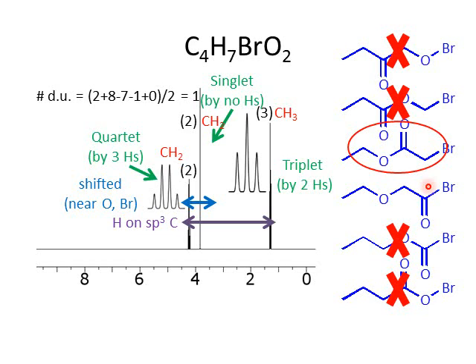If we had other spectra, like IR or carbon-13 NMR, that would also be helpful, because for an ester functional group, that carbon in the carbon-13 NMR turns out to come at a slightly different place than for an acid halide, which is this functional group. Also in the IR, a CO double bond stretch is a little bit different for an ester versus an acid halide. But that's probably beyond the scope at this stage of the game.